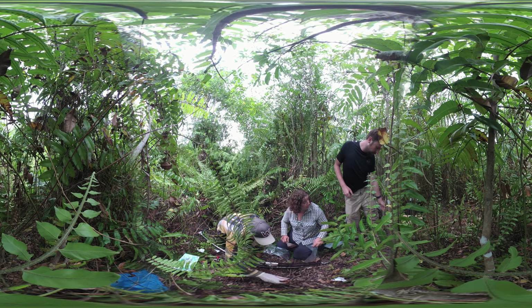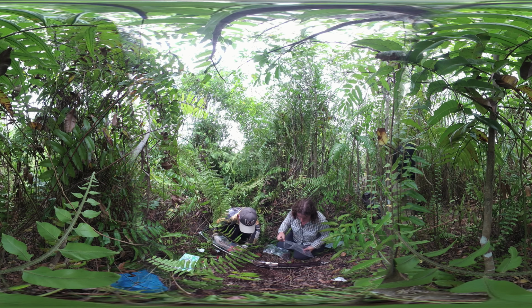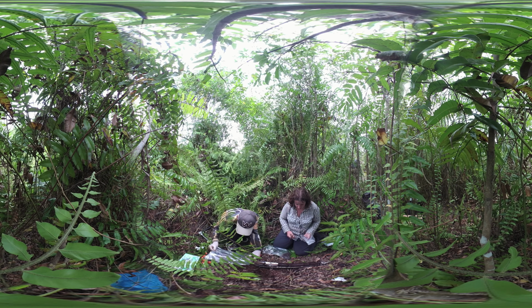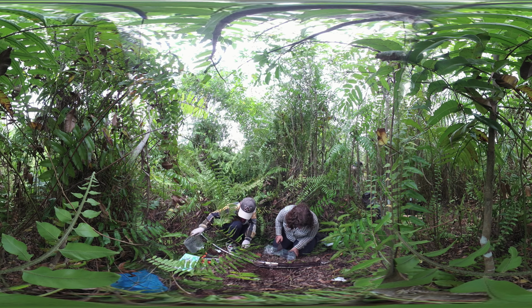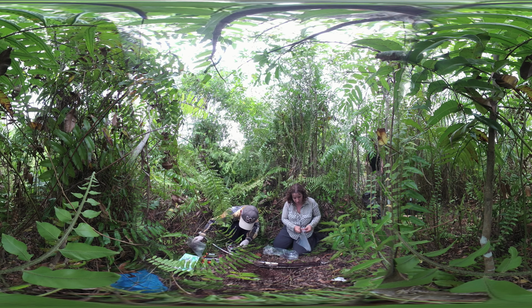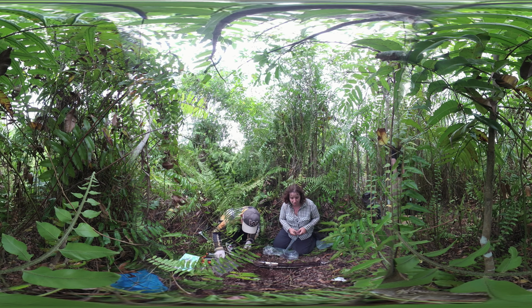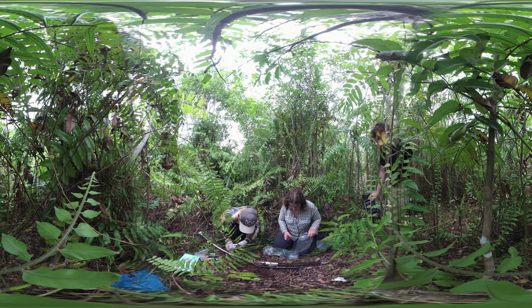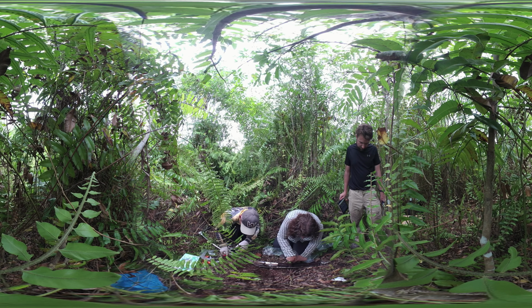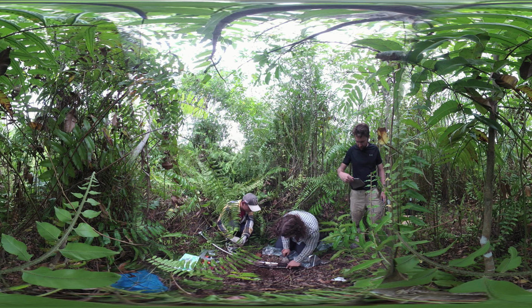Do you want me to say what chemistry we're doing? Yeah. So we're taking soil samples down to 50 centimetre depth at 10 centimetre intervals. Within those intervals we'll be measuring changes in the carbon nitrogen content, the pH, soil moisture, the bulk density, which is how dense the peat is.